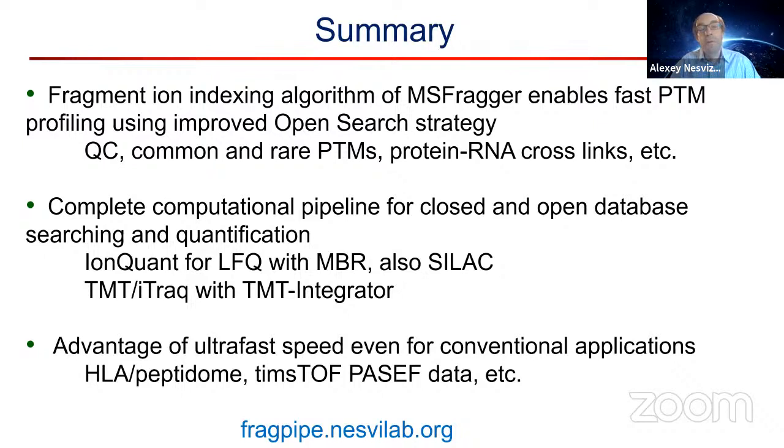So it's possible, yes. For low abundant proteins, we're more likely to start losing things when we increase the search space, and for intermediate and high abundant proteins, we'll be gaining. So on average, we gain, but not for every protein.